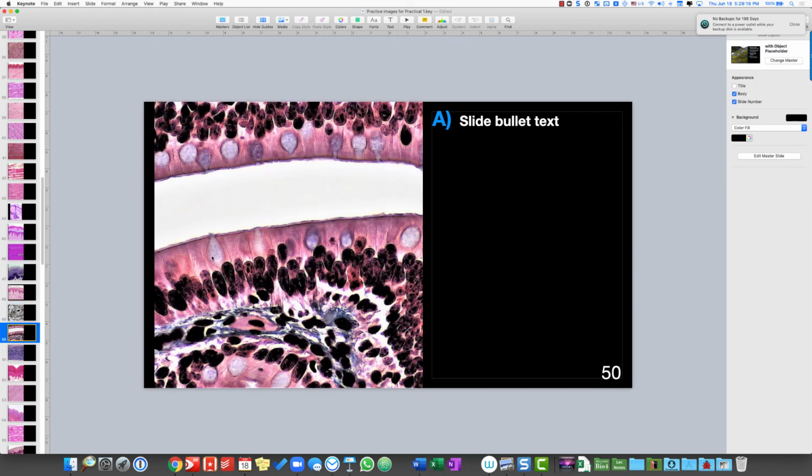This one is actually simple columnar epithelium, as I mentioned in lecture. This one looks deceivingly like pseudostratified columnar epithelium, but it's actually simple columnar epithelium with microvilli. Okay. And then here we've got goblet cells. Okay. Well, why? How do I know? Well, just from having had the experience of looking at a lot of these.